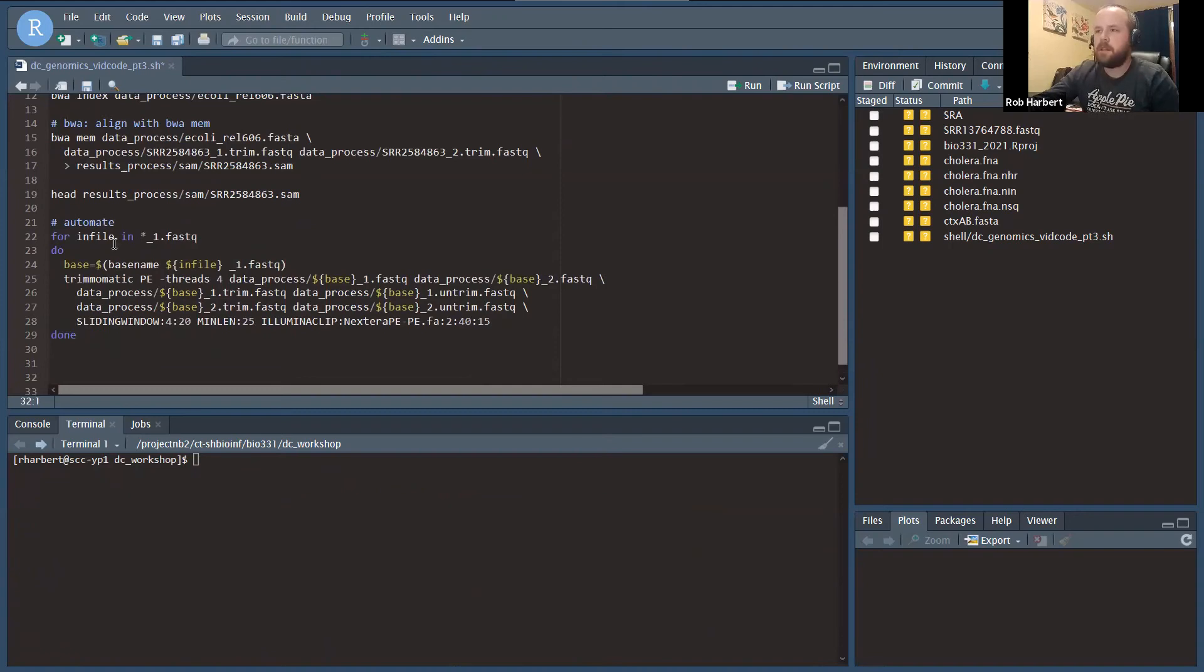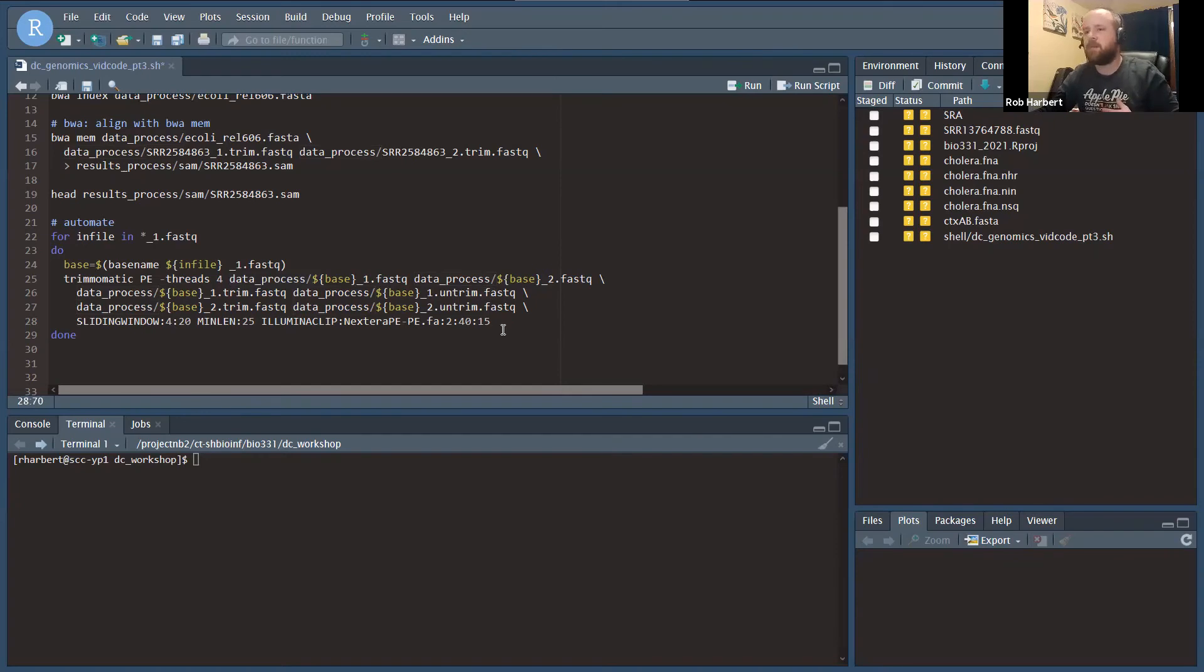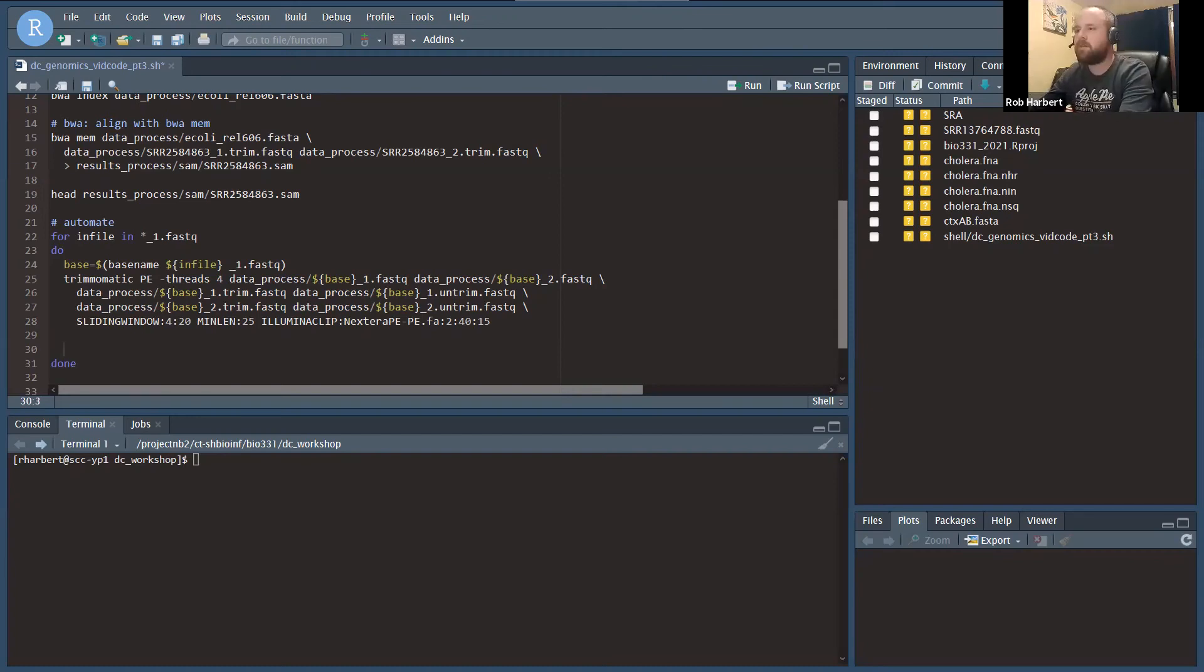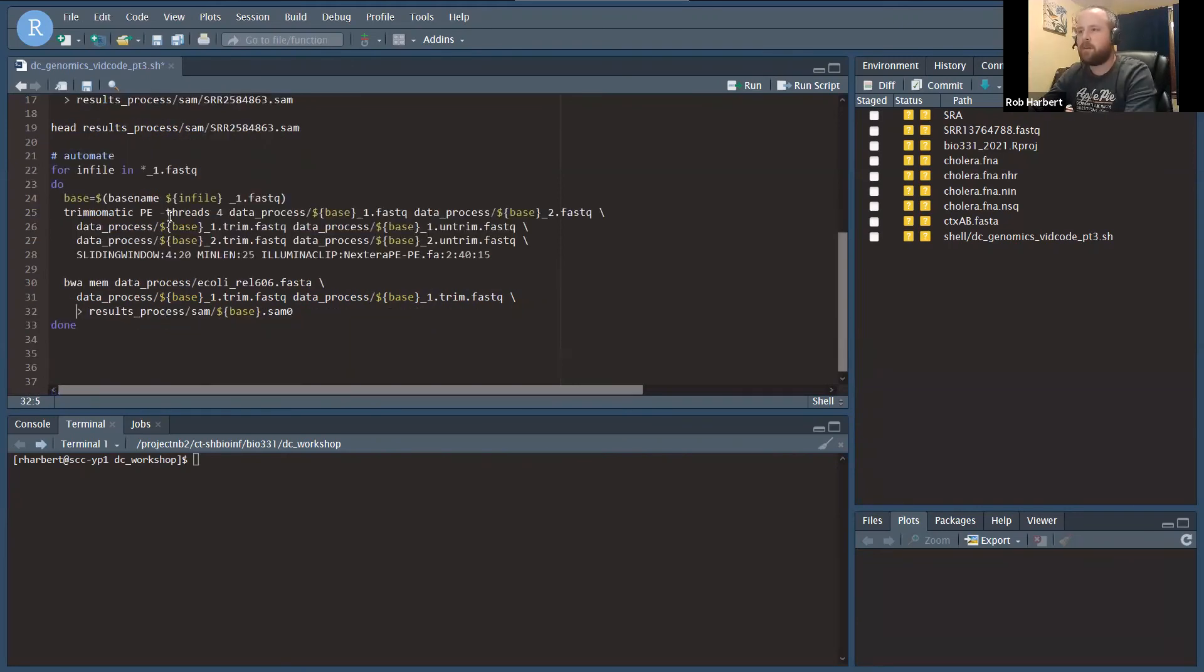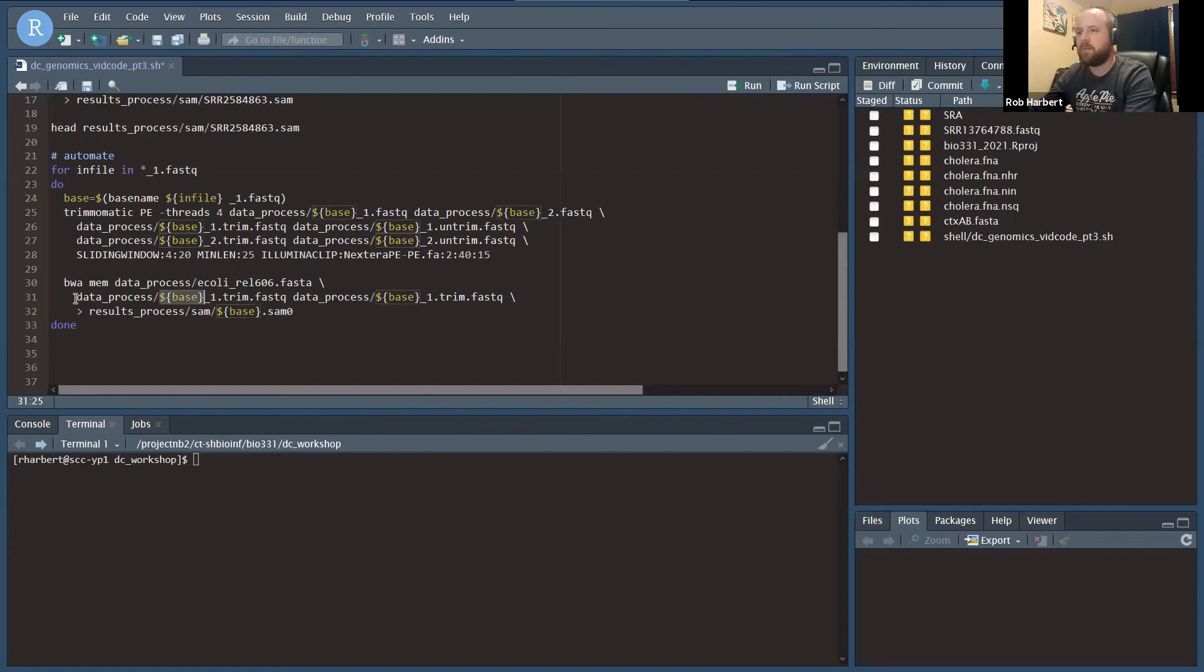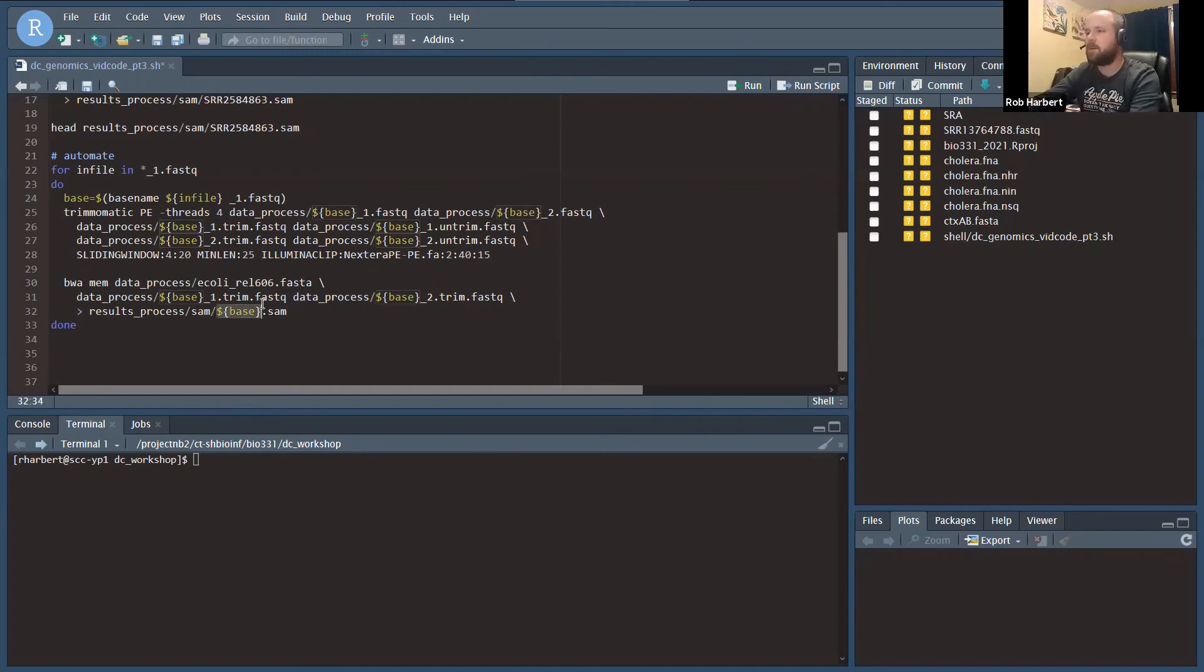Here is a bit of code I've modified from the last video to run the Trim-O-Matic command inside of a loop for each of the files, but now I've added the data process relative path. We can run this from the DC workshop folder, but still access the data and data process. We're going to refer to the SRR number with the dollar sign curly brackets base, and then we can refer to the input data underscore one dot trim dot fastq and underscore two dot trim dot fastq, and then we'll output to results process SAM, but this time we're subbing in the SRR number for the file name in the SAM files.